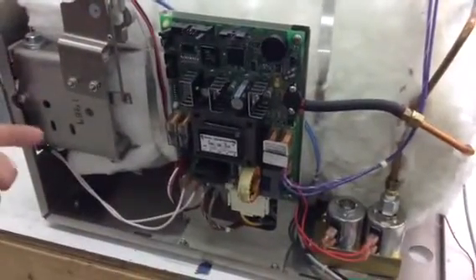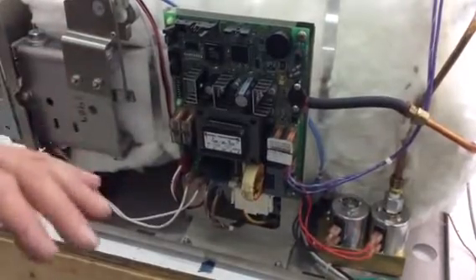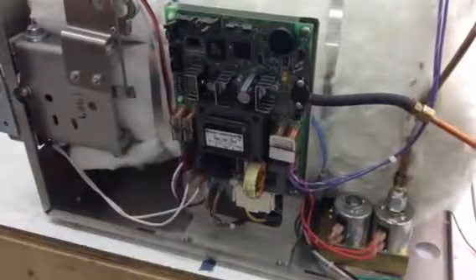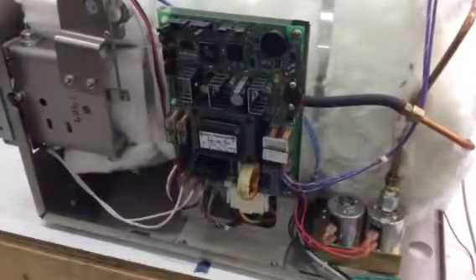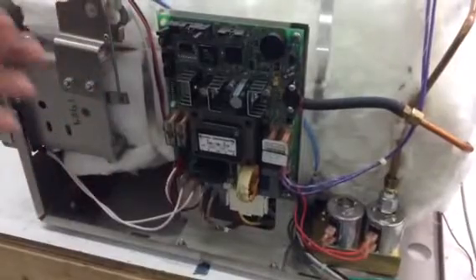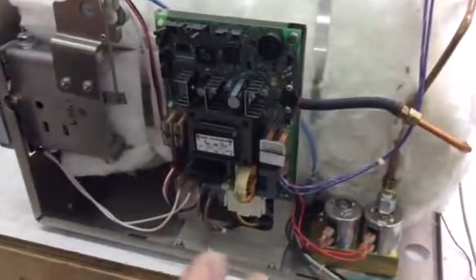Here at Sterilizer Autoclave Solutions, we do a lot of PC board repair. We repair pressure transducers, relays, bad solder joints, fuse holders, and capacitors — we replace and fix a lot of that stuff. So if you need a PC board repair, you would have to take the board off to send it to us.